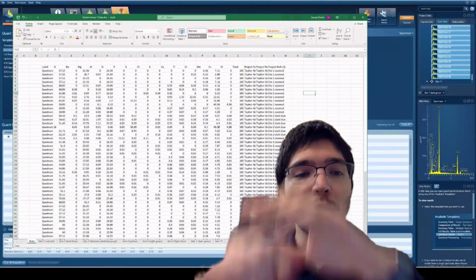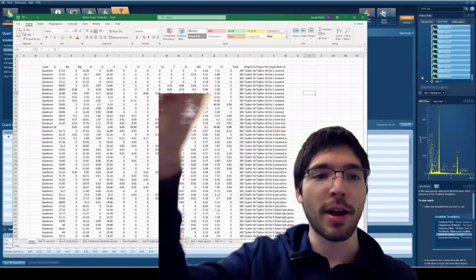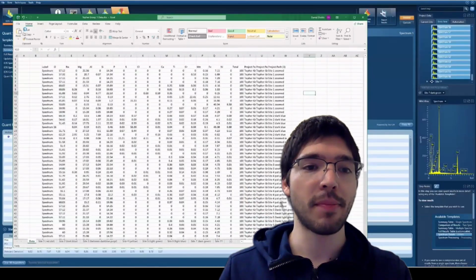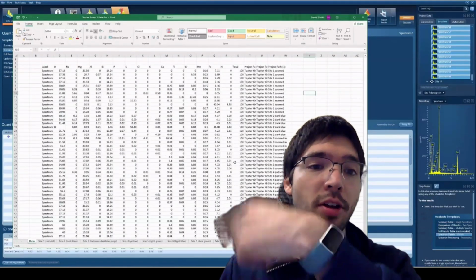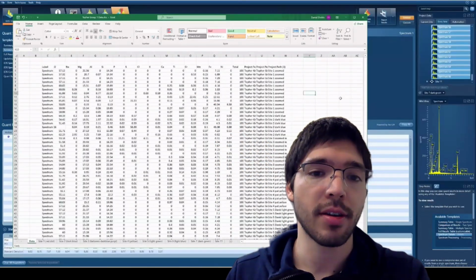With our technique, you can show this large area that looks very clean, and then you can just put rectangles over each of them. So you essentially move the beam to the sample rather than the other way around. And that makes it where, depending on how long you set your counting times, you can get way more spots a lot quicker.